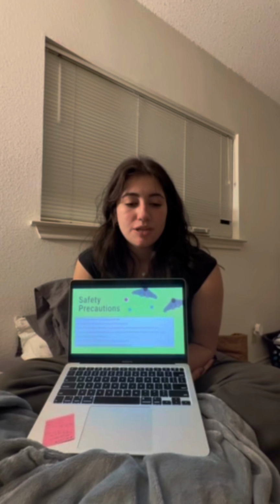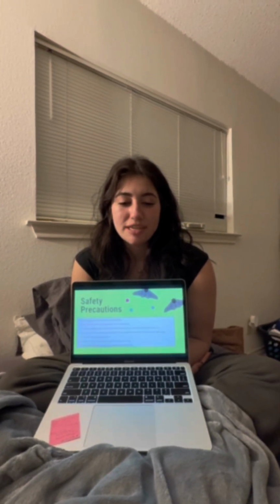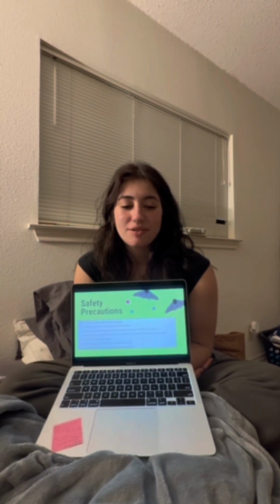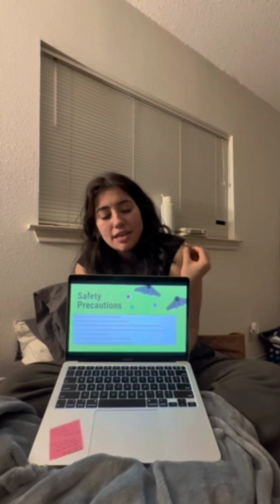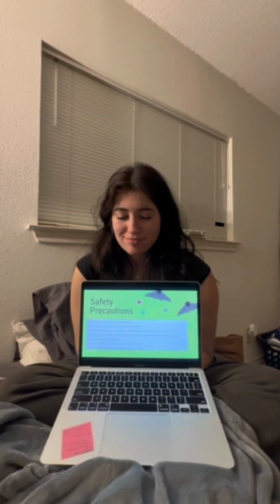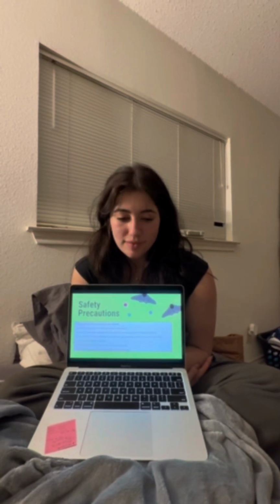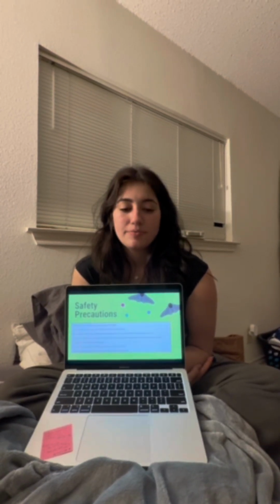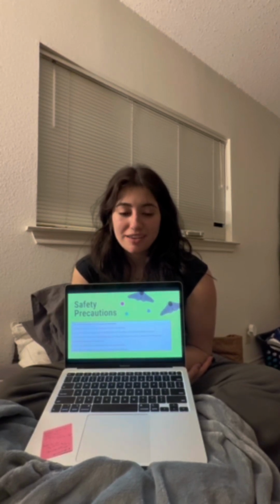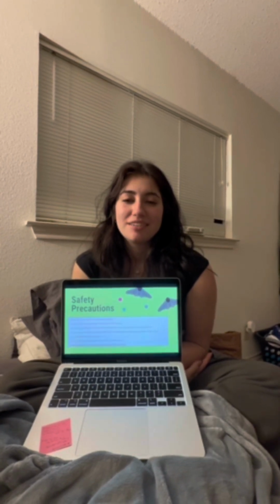And we need to ensure that the power button is in the off setting when handling the gel because the electrophoresis unit is sensitive at high voltages, and we need to make sure not to touch the electrodes on the electrophoresis units. We need to confirm that the amber filter is in place to protect our eyes from the UV light emitted, and we never leave the electrophoresis units unattended during operation.